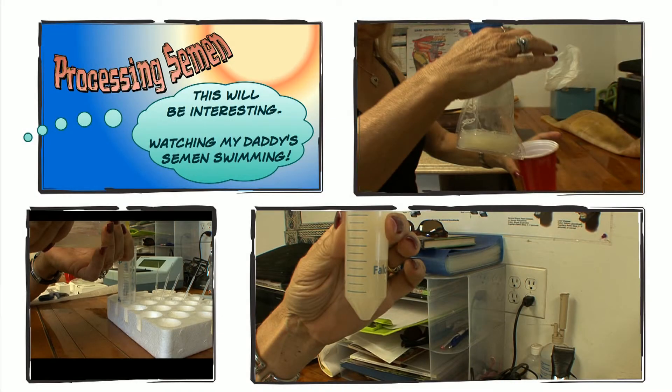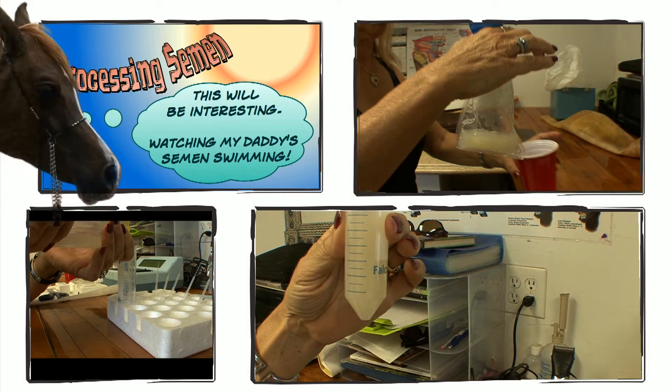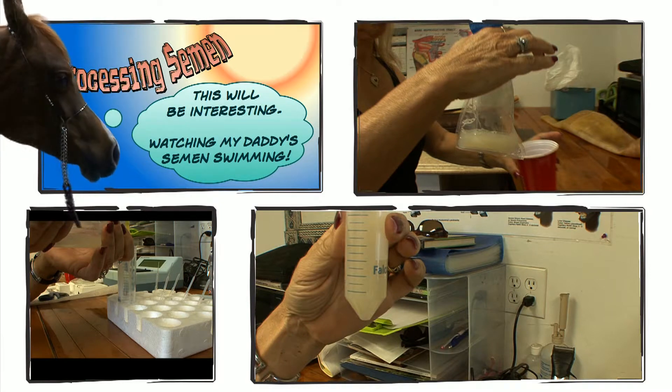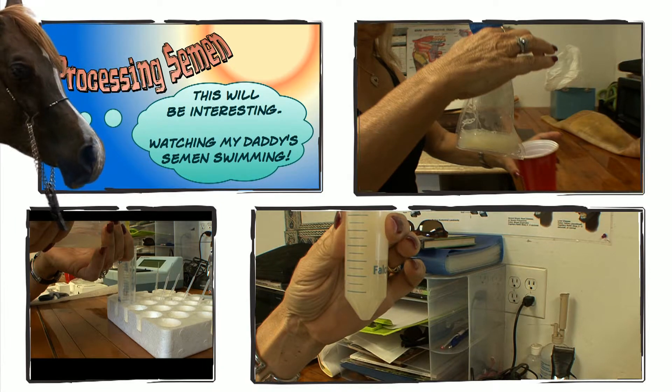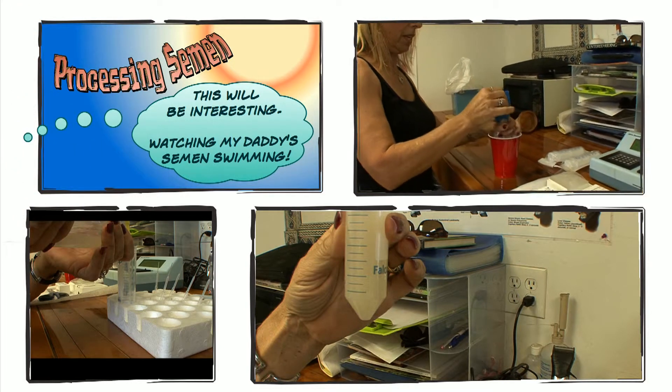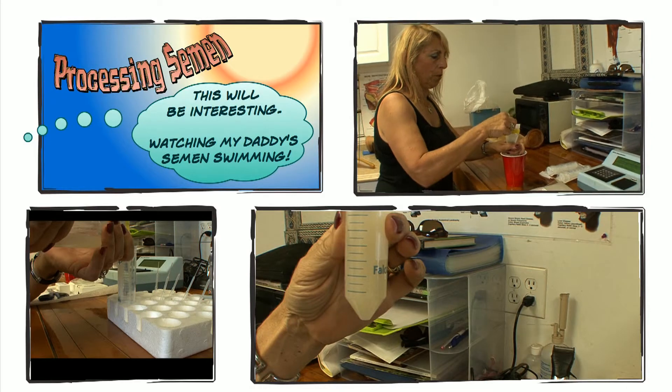That is the ejaculate that has come through the filter and into the bag, and we're going to rush this into the lab. Snickers, I don't know if you can get in the lab, but you can stick your hat in here. I'm going to remove the ejaculate, place it in here. I'm going to then remove the filter.